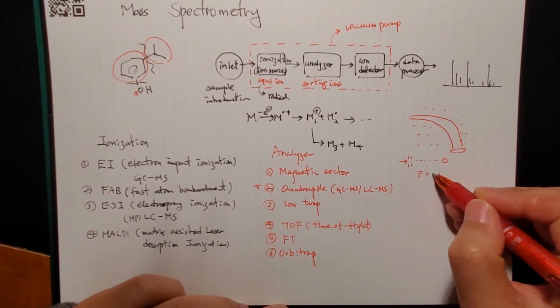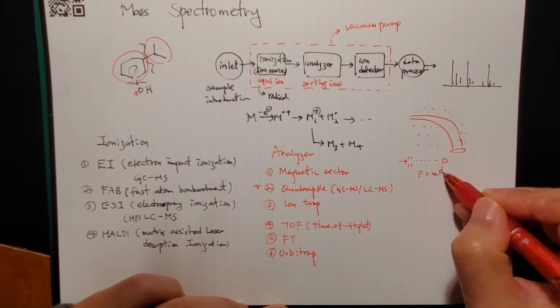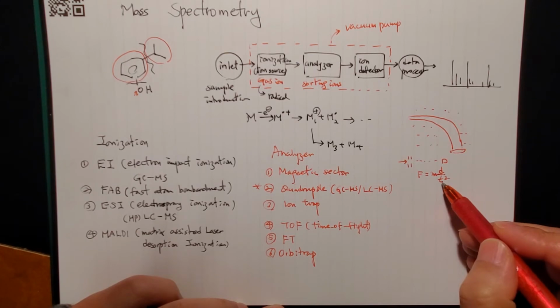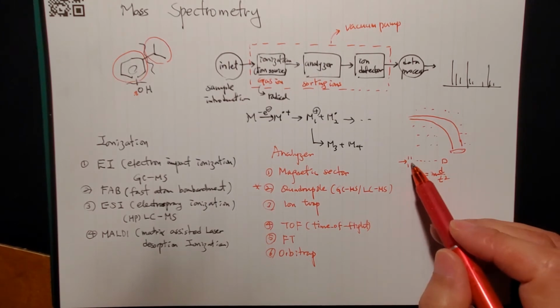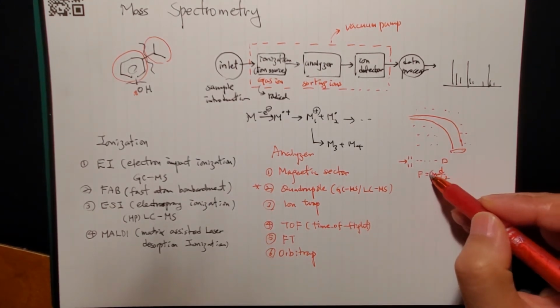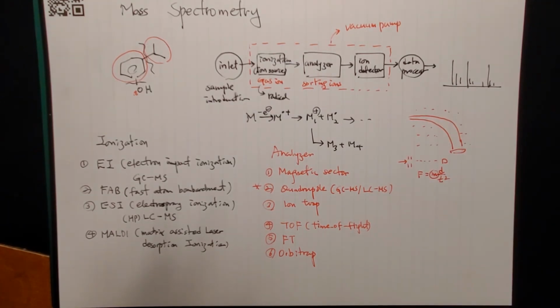So if the distance is fixed, if you measure the time for a certain ion to reach the detector, we can measure the molecular weight.